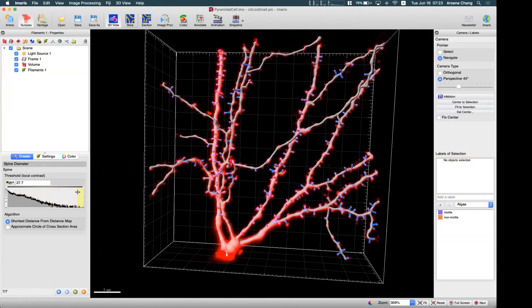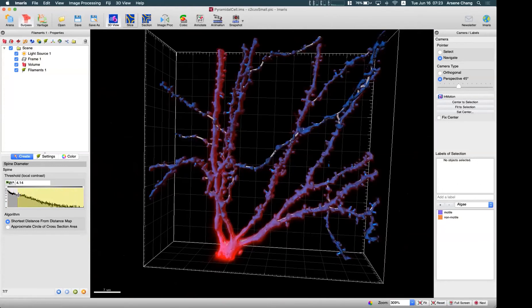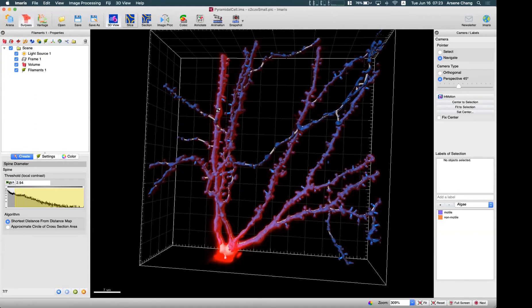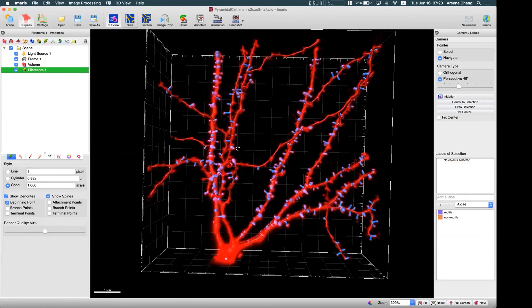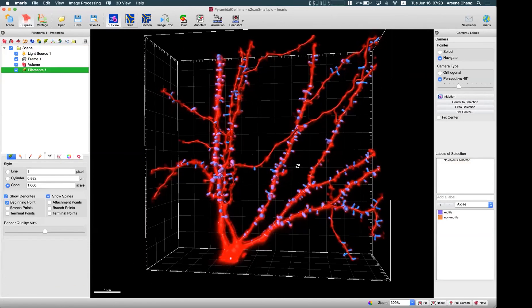The spine detection is now finished. We calculate the diameter of the spines, which is the same process as for the dendrite/filament diameter. That gives us our initial tracing result.